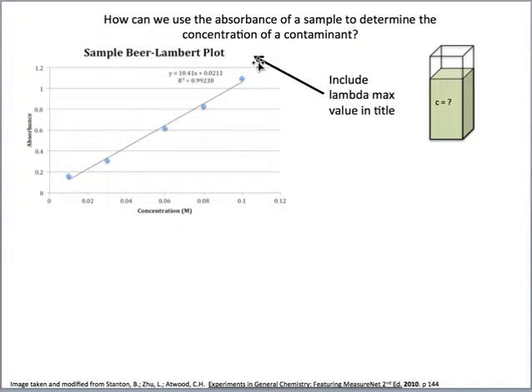All right, so back to this. We have our linear fit, and with that linear fit, we can get a nice equation that goes with that, and we can do all that with Excel. And if you're having problems with Excel, I made a short video where I actually demonstrate how to graph something in Excel. So hopefully that'll help out a little bit.